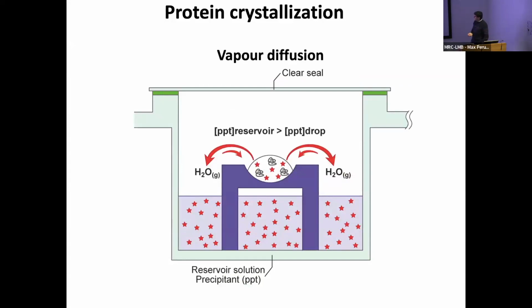This is just to show you a bit of how this works, slides from Fabrice. This is how the vapor diffusion process occurs.